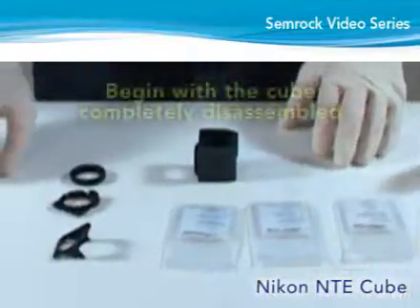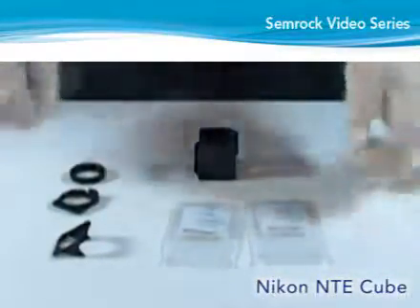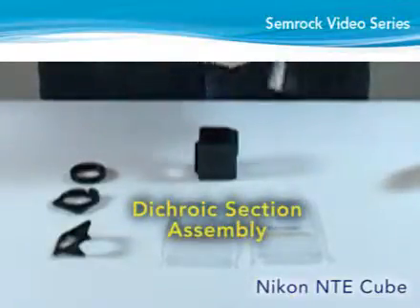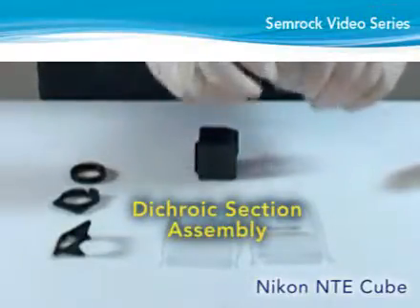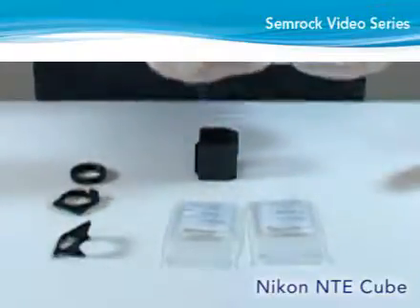Begin with the cube completely disassembled with all of the parts laid out on the work area. Assemble the dichroic portion of the cube first. To begin, orient the main portion of the cube with the exciter site facing to the left.